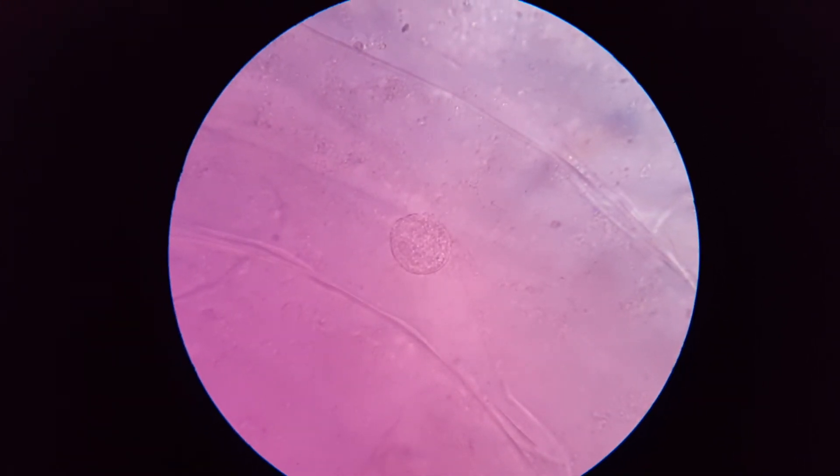You can even see the nucleolus in there. You can clearly see the cell wall and clearly see the nucleus. So this is a purple onion, and I'd say that worked just about as well as it might have worked. This is the thousand-fold magnification.